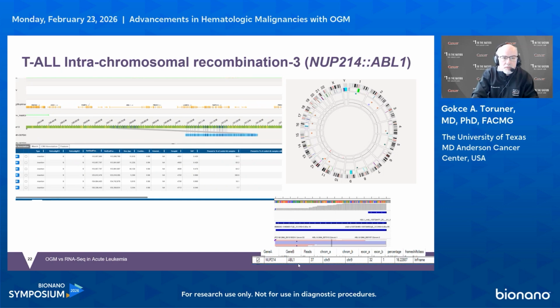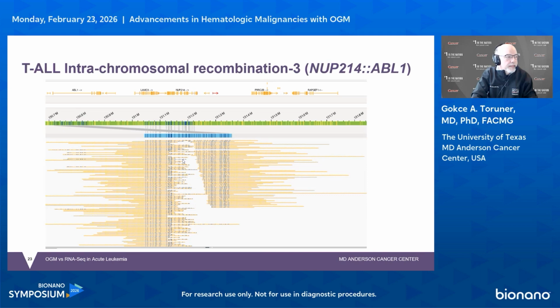But I was curious why we are not seeing that. One of the strengths of the OGM is also the supporting molecular data. Here's the supporting molecular data for this consensus map. And when you look at this, it is evident why we don't see this blue consensus map.